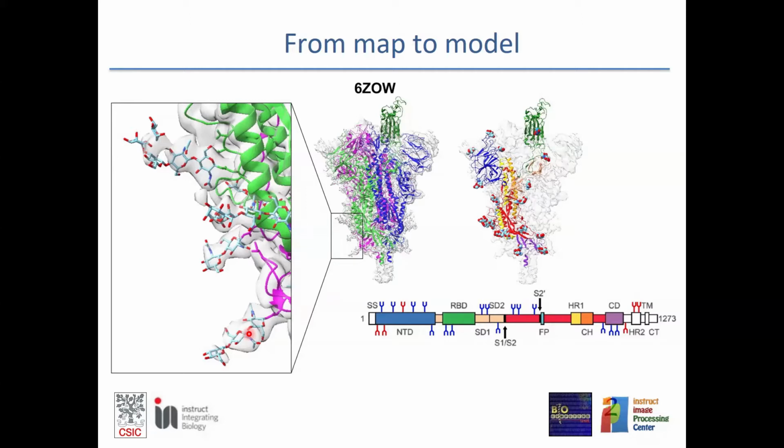And we know that in our case, each protomer of the spike contains 22 glycosylation sites or sequons, and in this case you can see in the protomer A depicted 16 of these glycosylation sites. Compared with the previously published structure, we were unable to find additional glycosylation sites, but instead we were able to extend the length of these glycan chains that were already known.